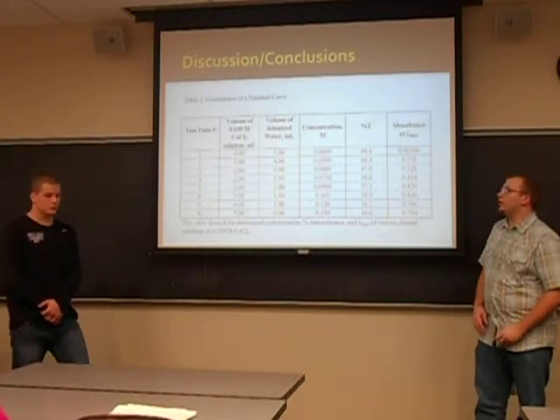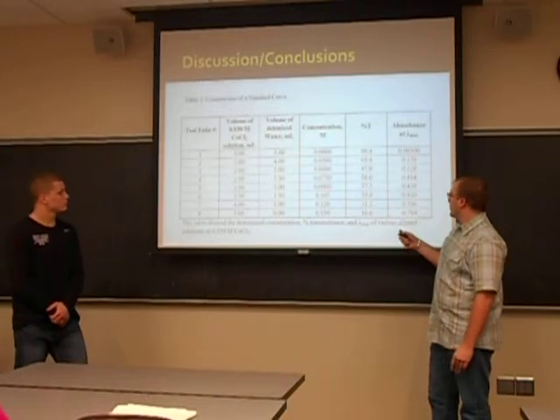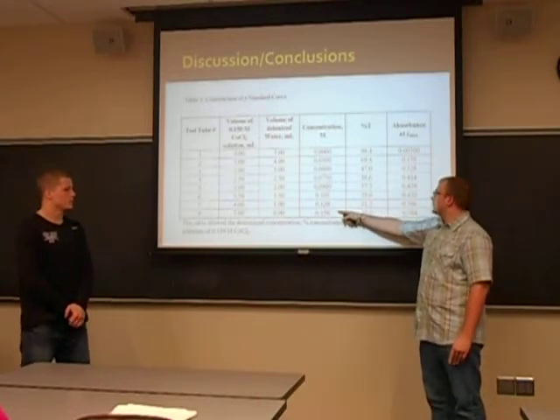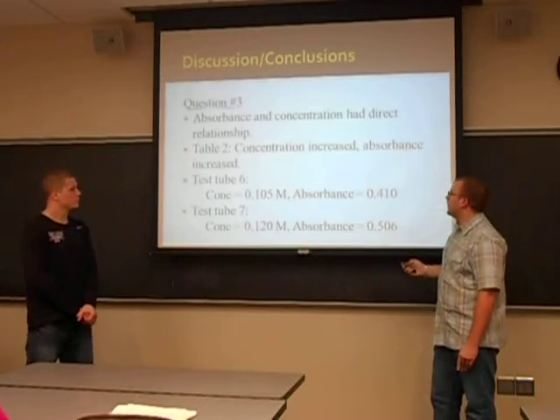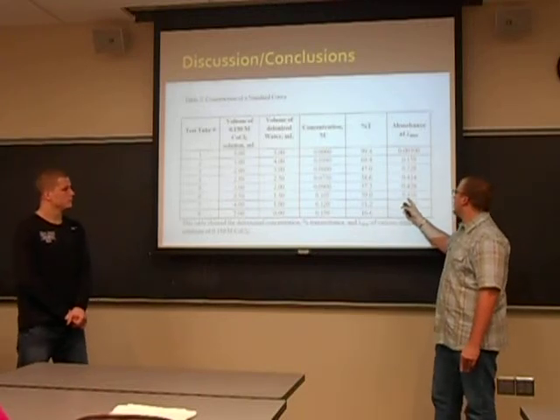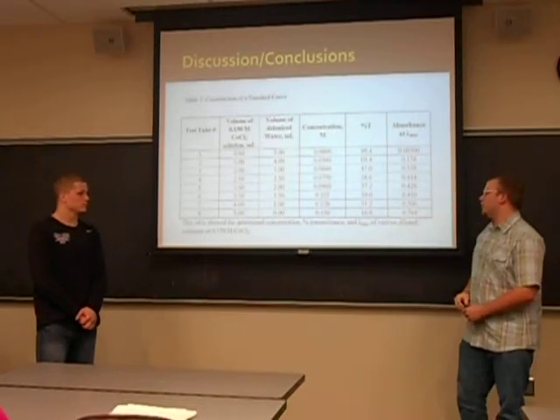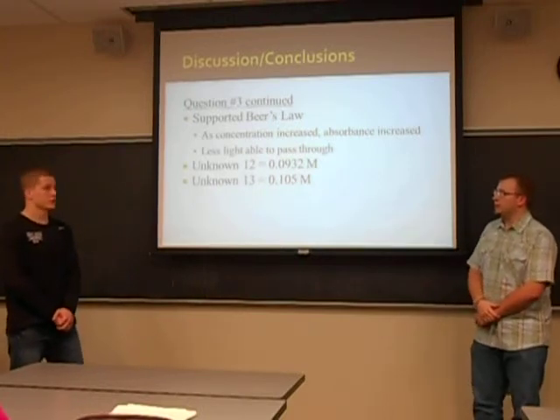And this is in figure 2, you can see it right here. 0.105 molarity here, and it increases, the absorbance goes to 0.410, and when the concentration increases to 0.120, the absorbance increases to 0.506. So our question 3 continued.